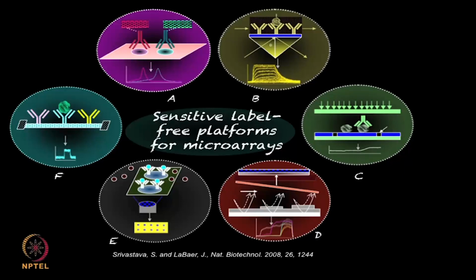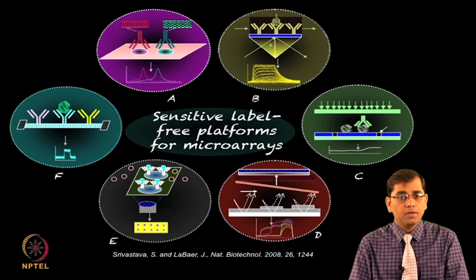Also, there are some nanotechnique based label free methods which we will discuss in our subsequent lecture, but some of the label free techniques shown here are very promising for high throughput protein microarray or DNA microarray based applications.